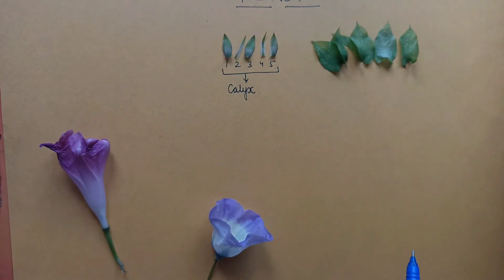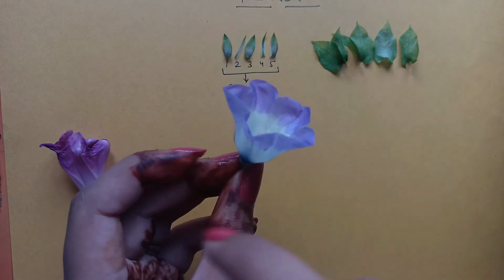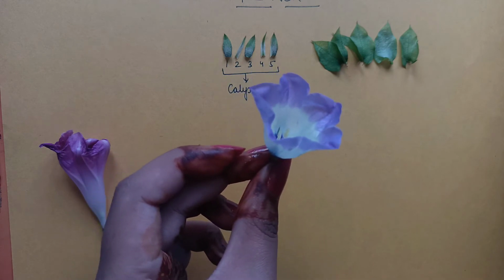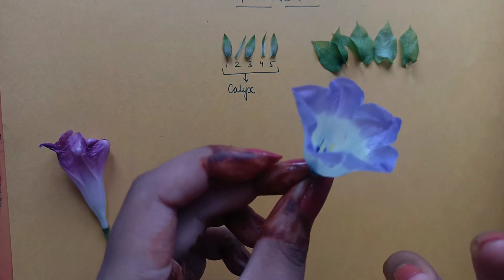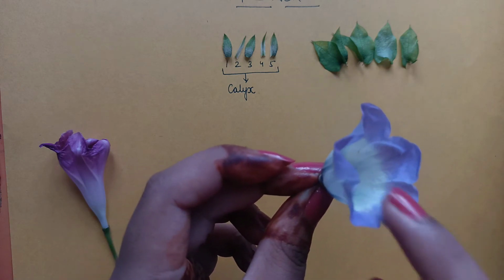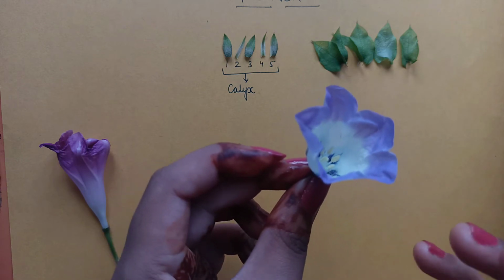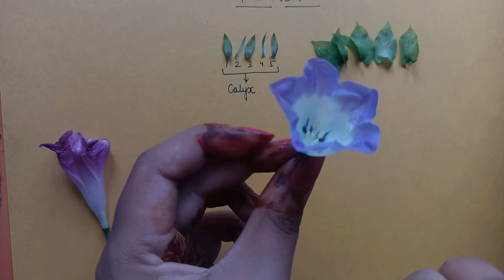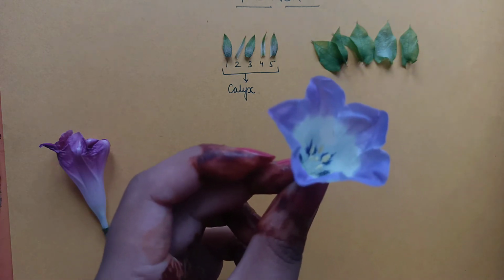Okay, now after sepals we have petals. We have this colorful part, that is the petal. It is the most attractive part of the flower, and they may be scented. They are attractive because their function is to attract insects for pollination. You will study in classes what pollination is. So this whorl is formed by petals.